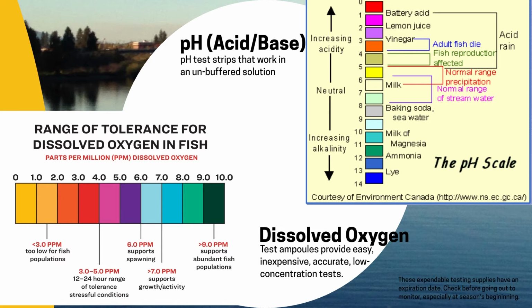IDAH2O also does not measure nitrates or phosphorus. In the early years, we had the capacity to hold twice-yearly snapshot events where North Idaho Master Water Stewards could bring water samples to the University of Idaho Coeur d'Alene Center for more sophisticated analysis. The detection limitations of common nitrate and phosphorus test kits or strips are too high to measure the relatively low concentrations in most of Idaho's waters.